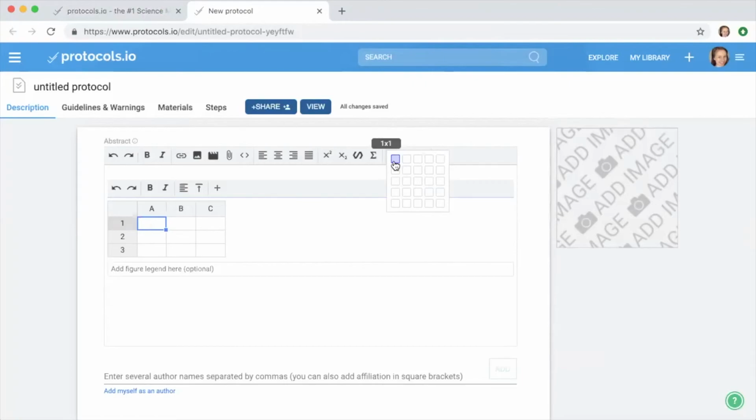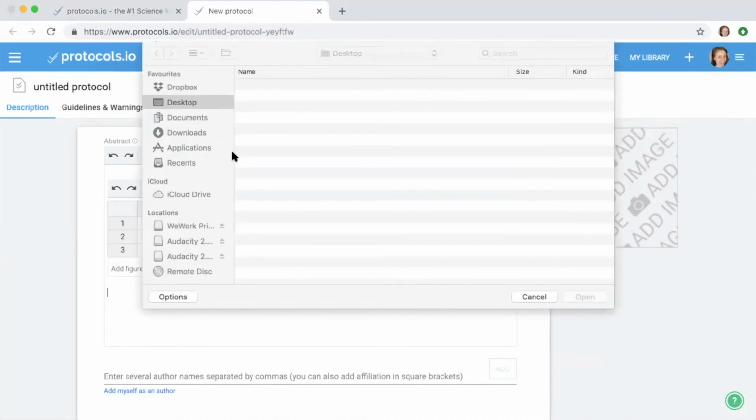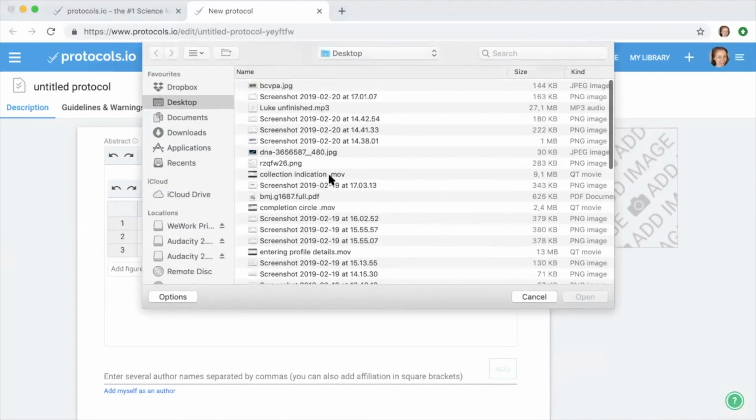I guess so. If it's a big table, how big is big? You can do however big you want here, really. But if it's too big, for example, if you have an Excel sheet that has a lot of content, you can also just attach a file. If you have a table that maybe people should rather download, you can attach a file here, select your Excel file, and then just add it here.